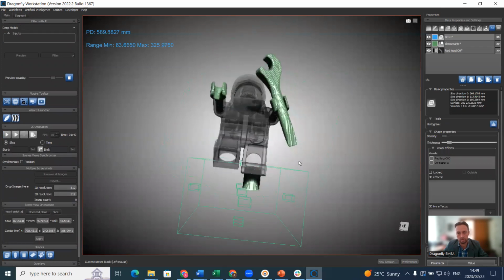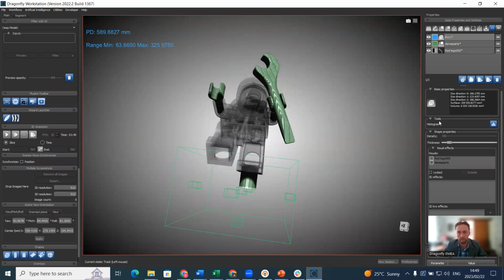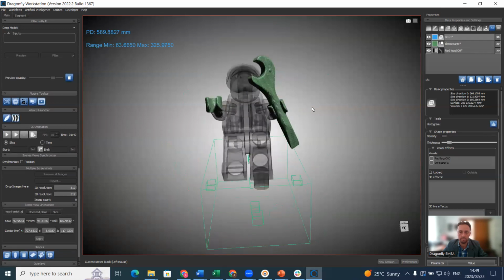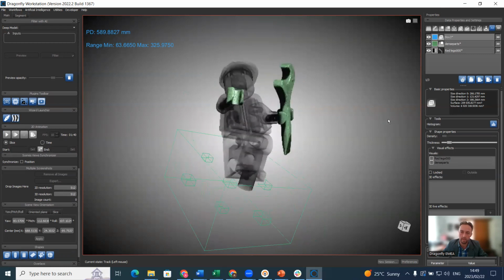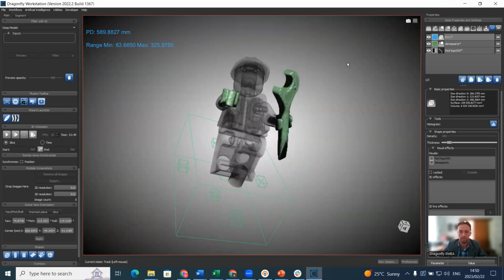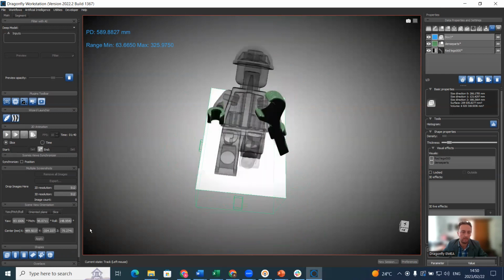So we put a box covering the area that we want to remove ROI from. If we now right click here, then we can say remove from structured grid, and we can say remove that from dense parts. So now we've got that removed in a nice way. So you can use various shape tools in that way to add or remove to a region of interest. You can, for example, also make, let's do a different thing.